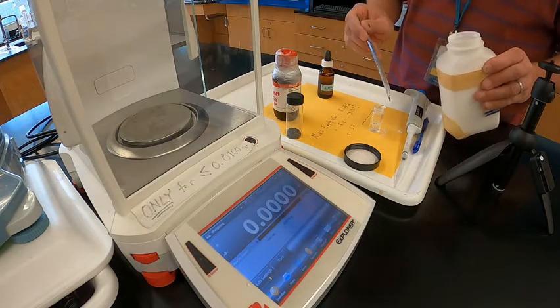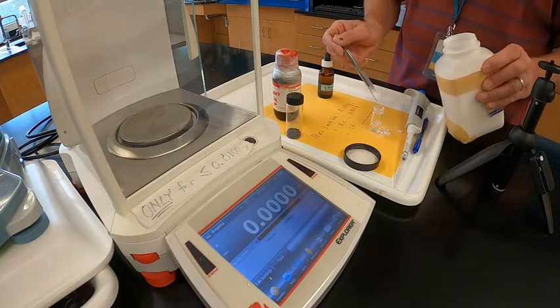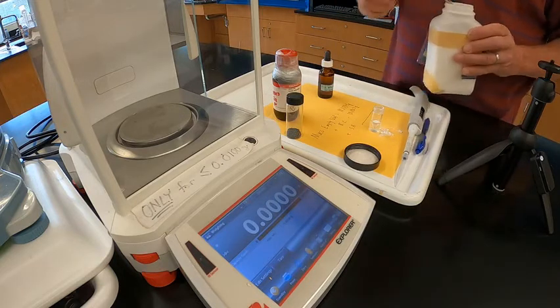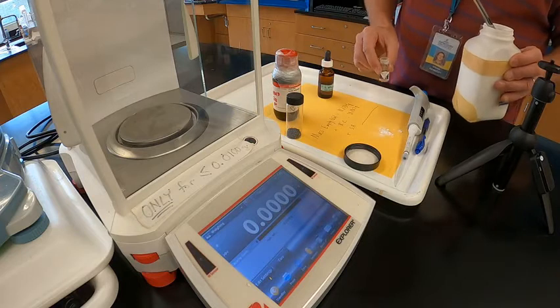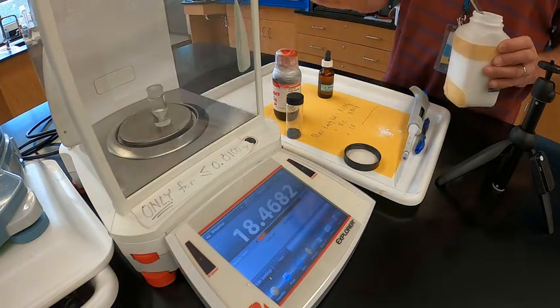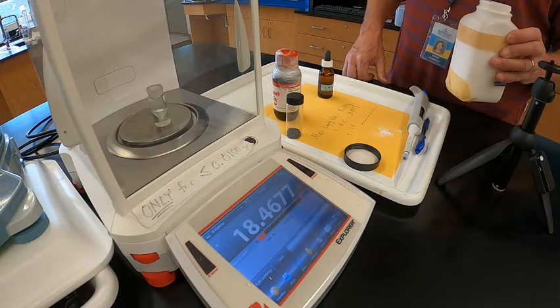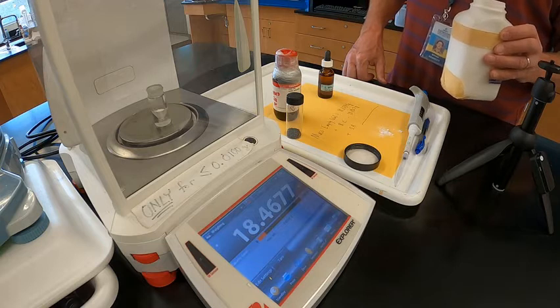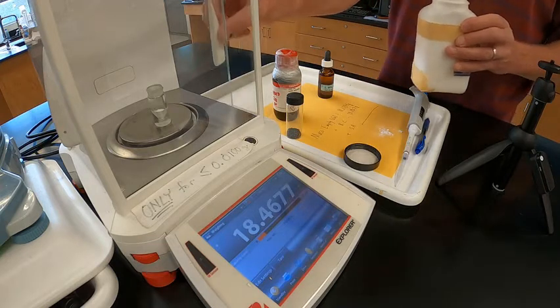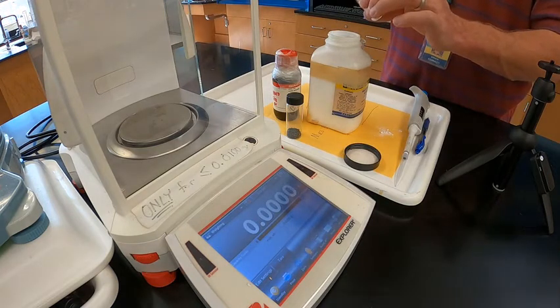Go again, and I always weigh things over a tray. You can see I'm doing this on purpose. By doing it over the tray, if I spill stuff, it's very easy to clean it up later instead of making a mess on a bench top. Now I have a little bit too much, 0.27. So I've got to take a little out. I overdid it that time.